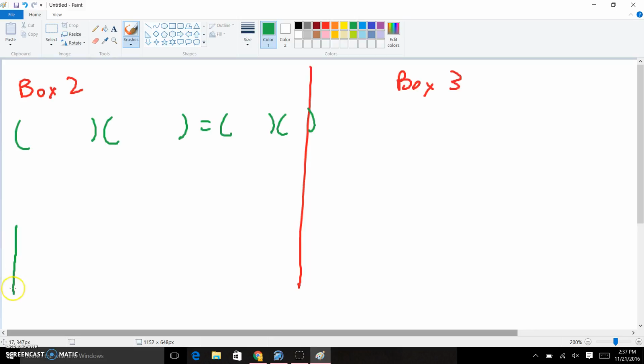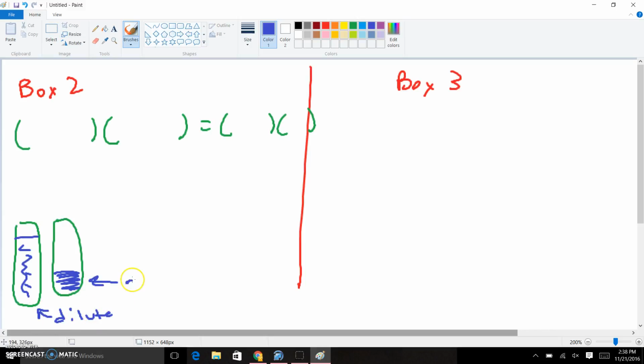So this is when you've got the two test tubes. And let's say you had the solution that was blue, you had the darker one that was here, and then this taller one was kind of the lighter blue one. So this one here was your diluted solution, and this one here was your stock solution. So when we're in the lab and we want to use experiments to determine the concentration of my diluted solution, what you're trying to find is the molarity.